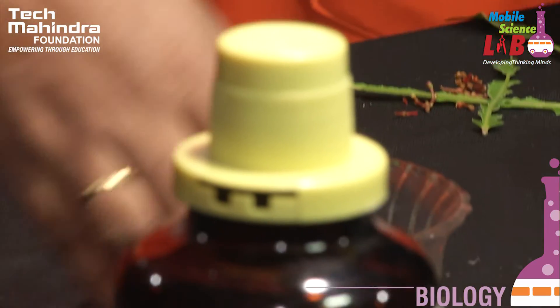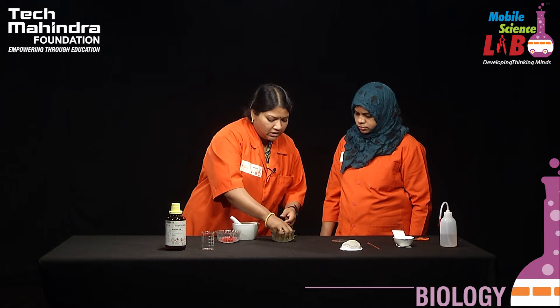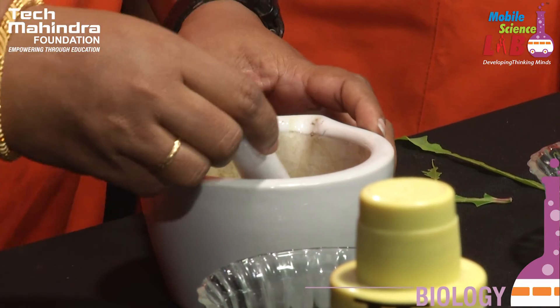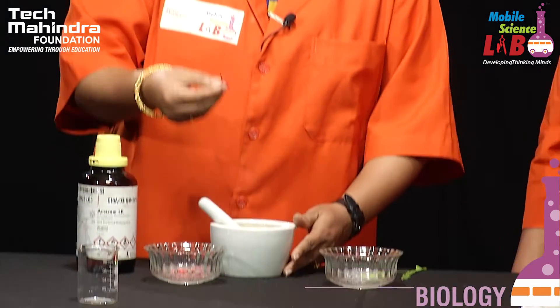Now we have to go for the extraction procedure, for which we need a mortar and pestle. This is a simple process of homogenization — we are bringing out the chlorophyll or the color pigment from the cell by grinding. We need a suitable solvent to extract the pigment, and for that we need acetone. Acetone is a solvent which will dissolve the chlorophyll from the leaf and the carotenoids from the flowers.